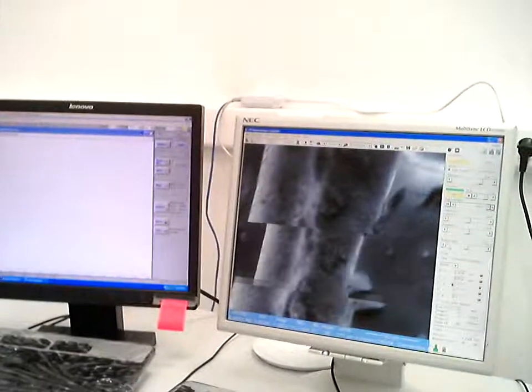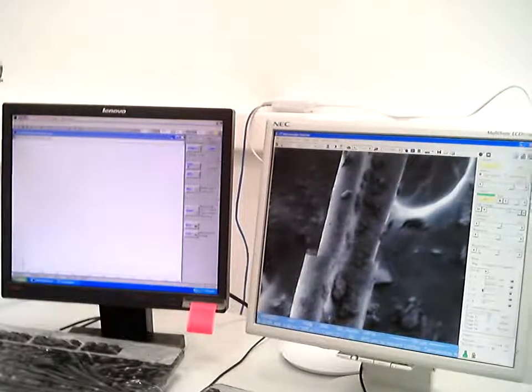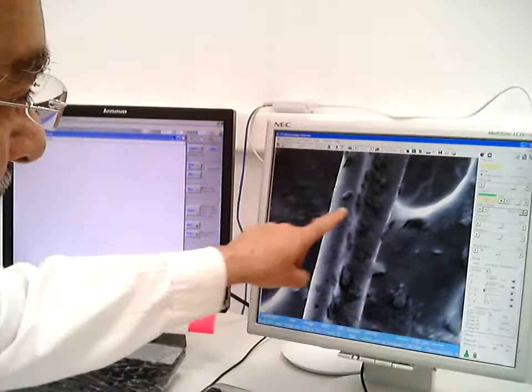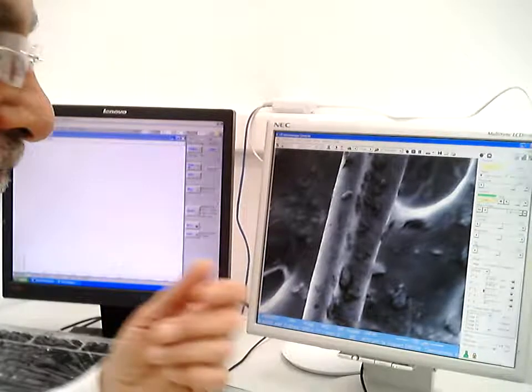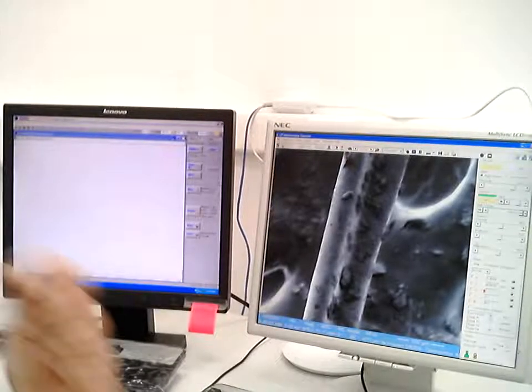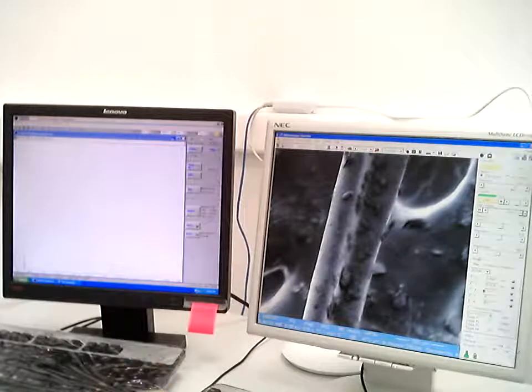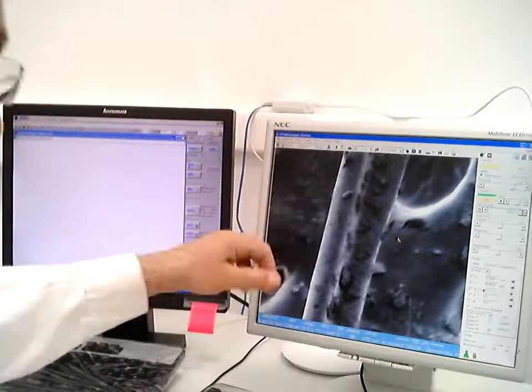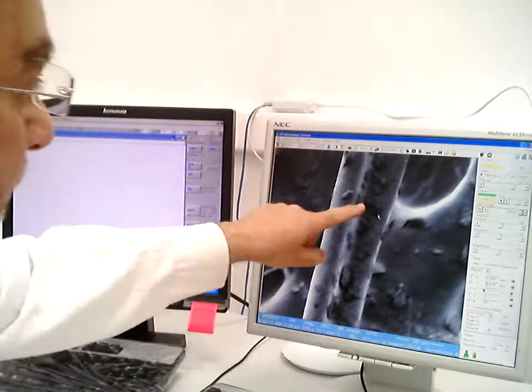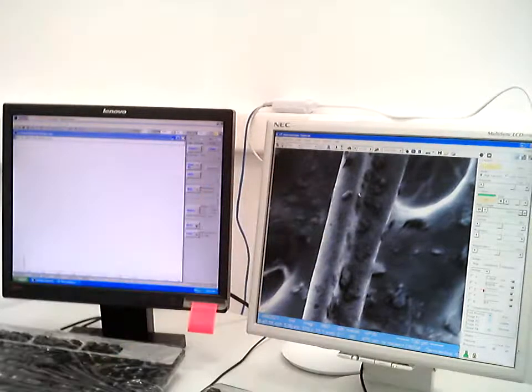Nearly always a double hair like this, in other words 2 or 3 hairs stuck together, usually comes from a beard. And this happens from my own beard, actually. So this is a very good piece of evidence. There is some rubbish on it, some things that were stuck on it, probably skin. So we can analyze this skin as well.